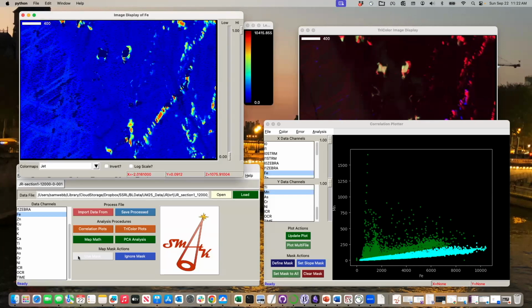Again, that's good if you're looking for a particular relationship that has a concentration ratio or count ratio that you're particularly interested in. And the narrower you make it, the finer you get, of course. So we're skipping ahead a little bit, but this is how I like to do this. As questions come up, we'll move around.